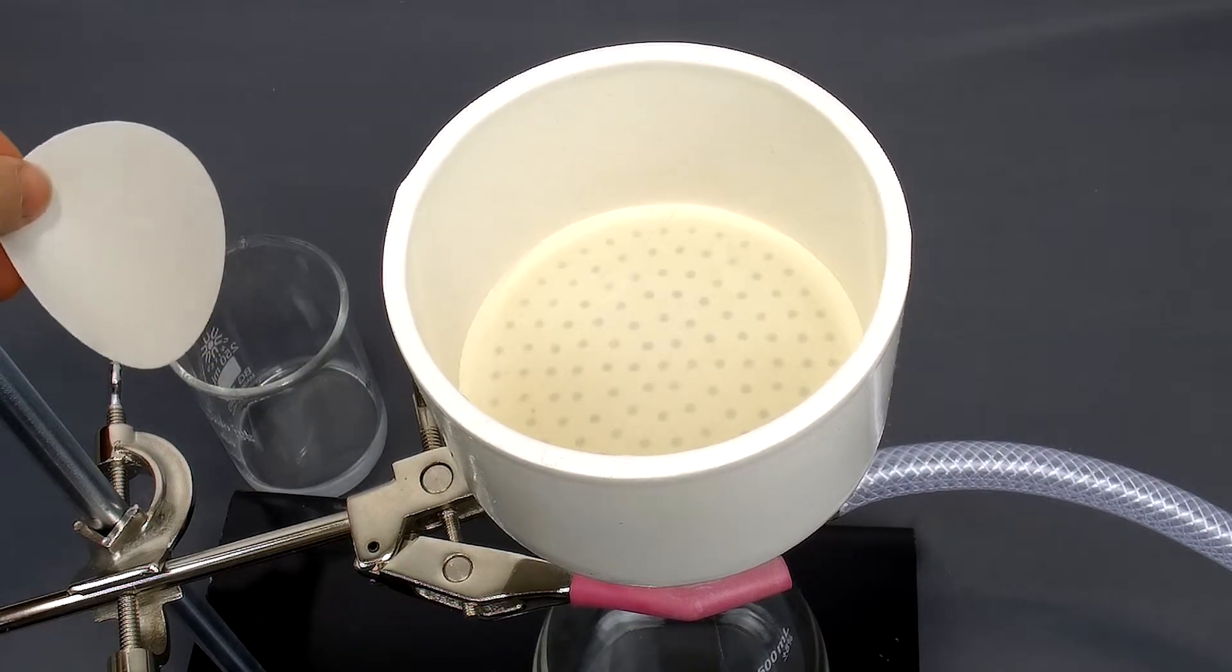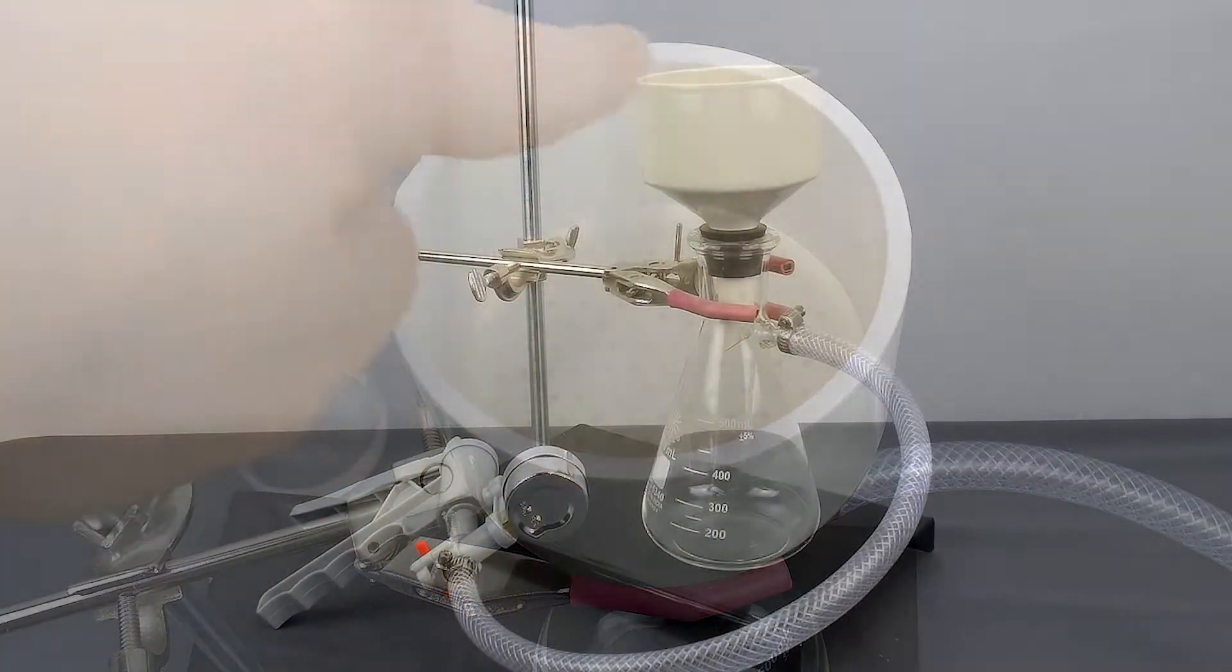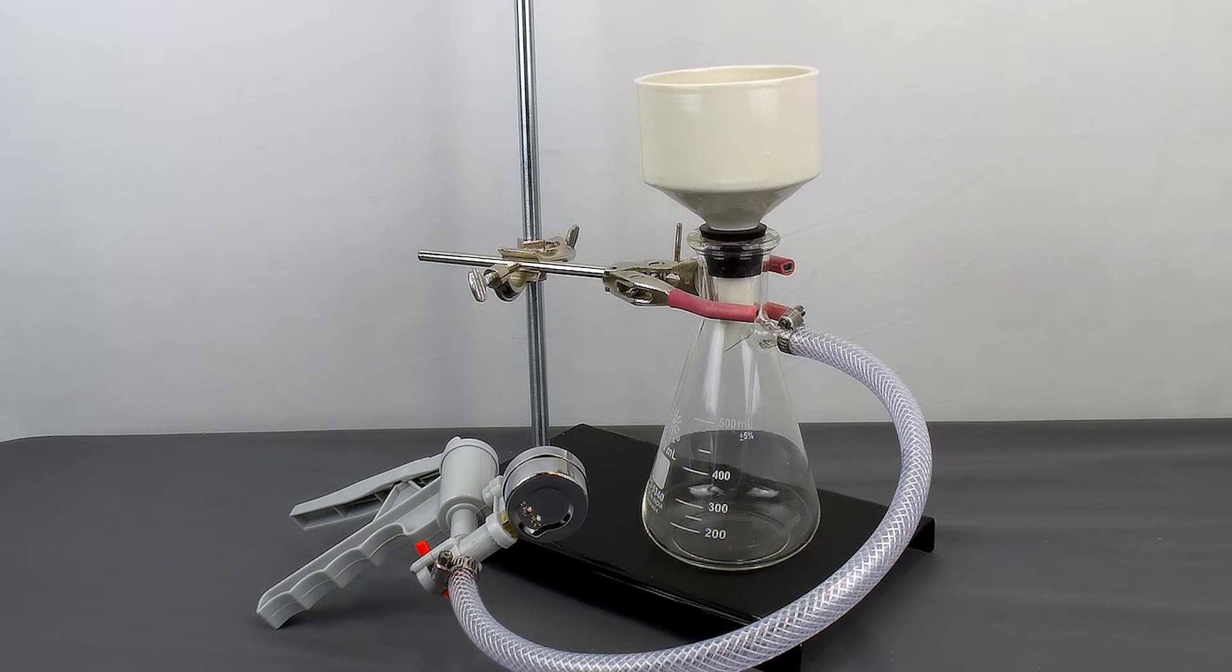To prepare for the setup, I just took one of the included filtering papers, soaked it in deionized water, got it all wet, and then placed it on the inside. Here's your complete filtering flask apparatus all set up and ready to go.